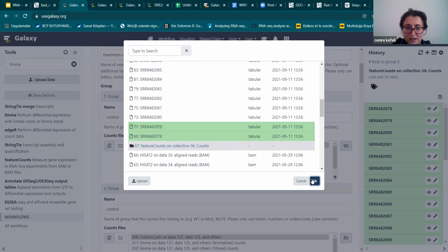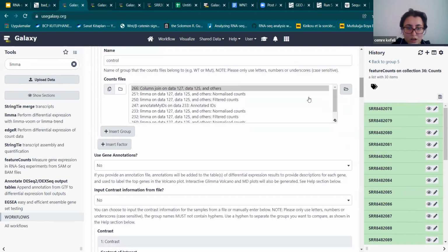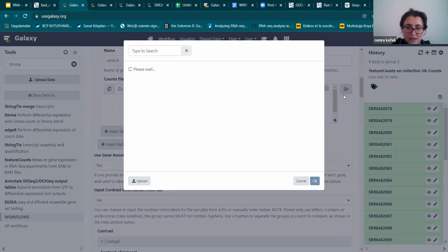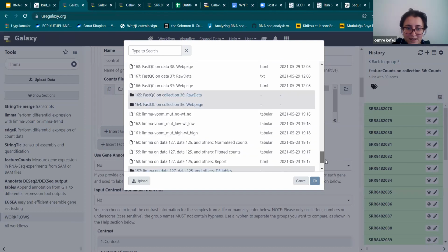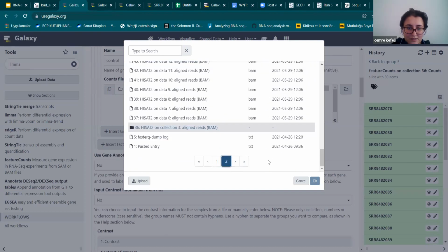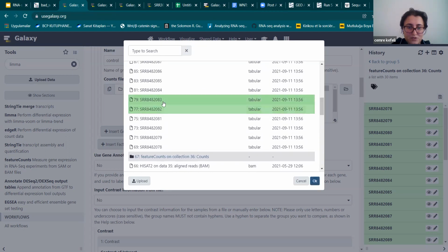You can choose here if you know, and you also choose control here. Let's say this is a mock test.